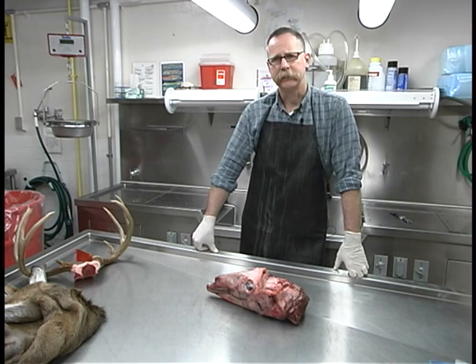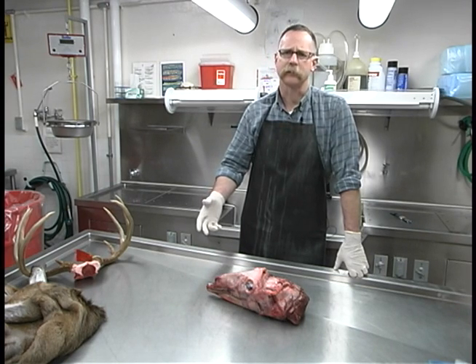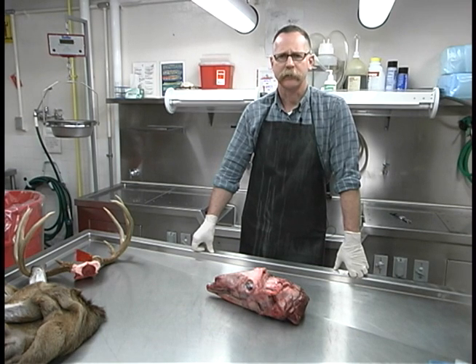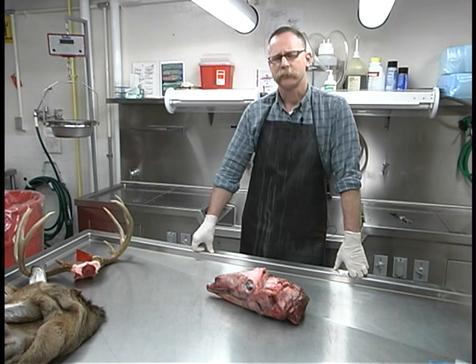This demonstration will be directed towards taxidermists because research has shown that in areas where chronic wasting disease is present, it's more likely to be found in adult male white-tailed deer, and it's the same deer that are more likely to be sent to taxidermists for mounting.